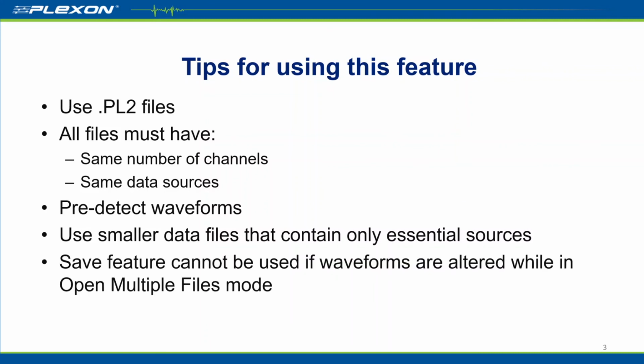Avoid long data processing times by using PL2 files that have only essential data sources like detected waveforms and events. Saving back into individual non-merged files cannot be used if waveforms are detected or redetected in Open Multiple Files mode.